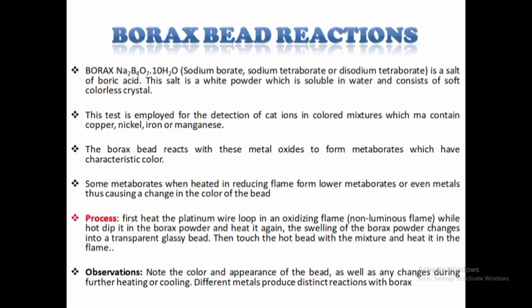Borax bead test. Borax, also known as sodium borate or sodium tetraborate, or disodium tetraborate, is a salt of boric acid. It is a white powder, and it's soluble in water. It consists of soft colorless crystals. This test is employed for the detection of cations in colored mixtures, which may contain copper, nickel, iron, or manganese.